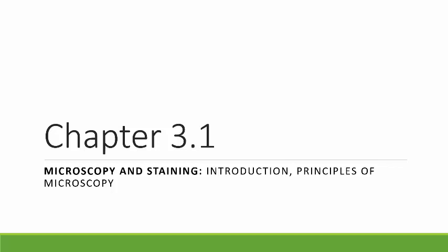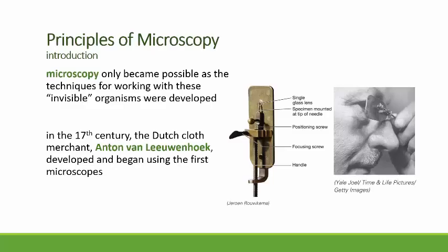In Chapter 3, we're going to try to understand how microscopes work, the primary tool that microbiologists have to work with, and the tools that we'll be using, especially light microscopes, and then look at staining and how we can use staining to make it easier to visualize the things that we want to see in the microbes we're looking at. So, let's get started.